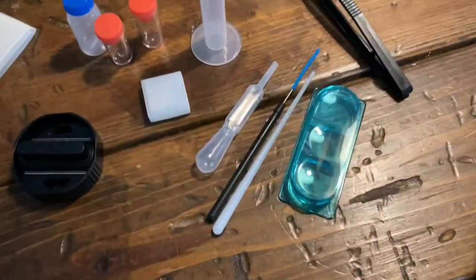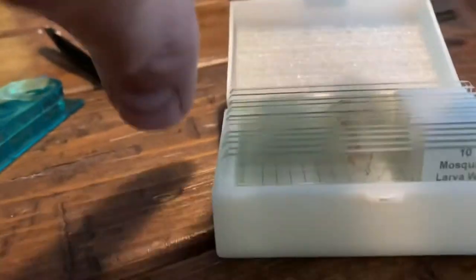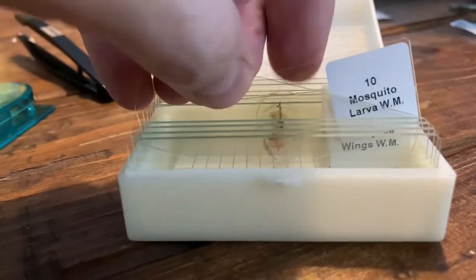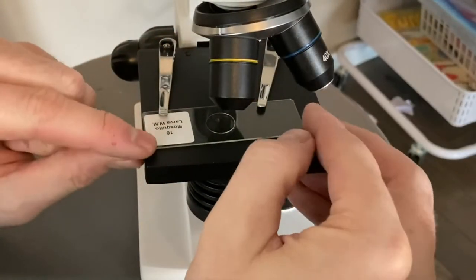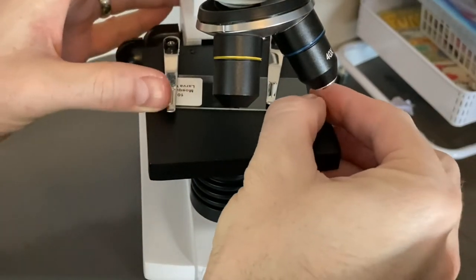Here are some of the other accessories. I'm not sure what all of them are, but there's clearly a little lab setup where you can mix things and make your own slides. There are small glass cover pieces you can place on top of blank glass slides. That's a great added benefit if you find something of interest and want to make your own slide.